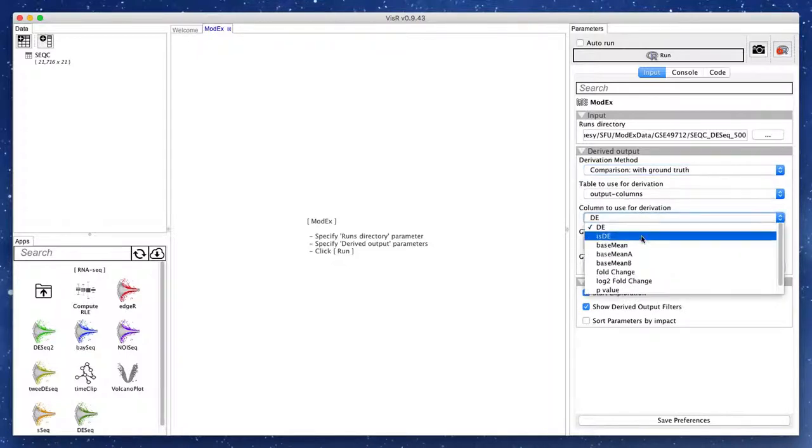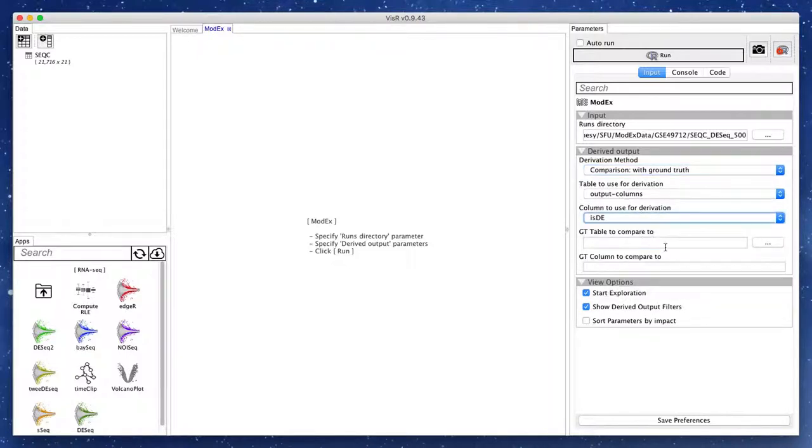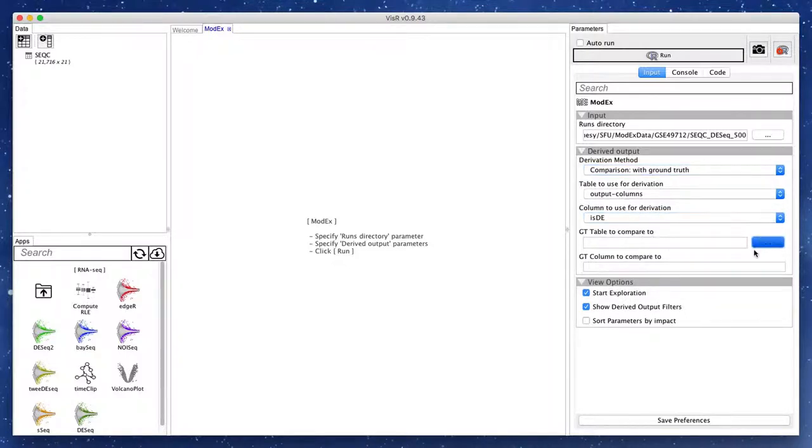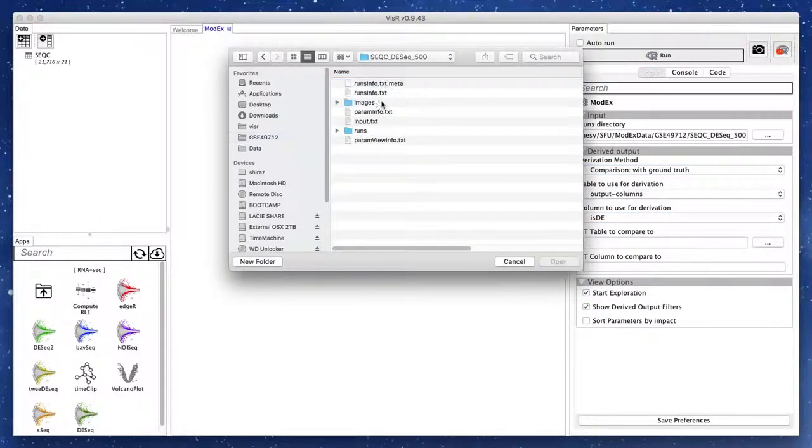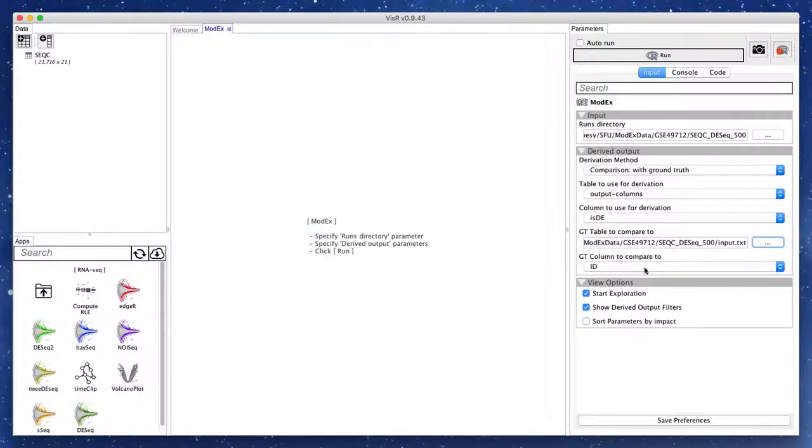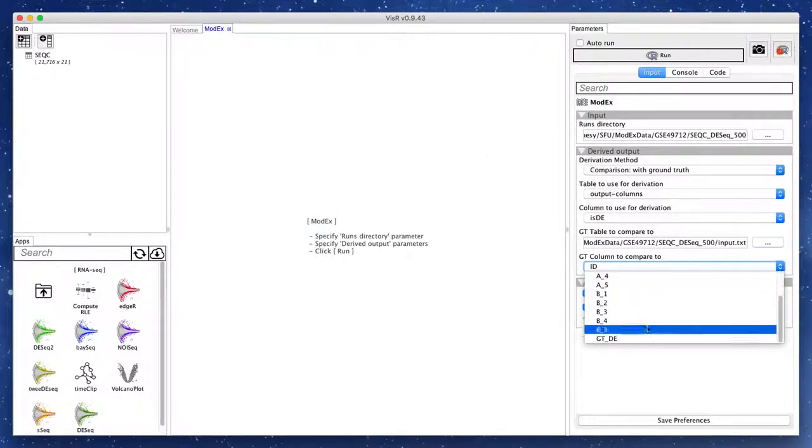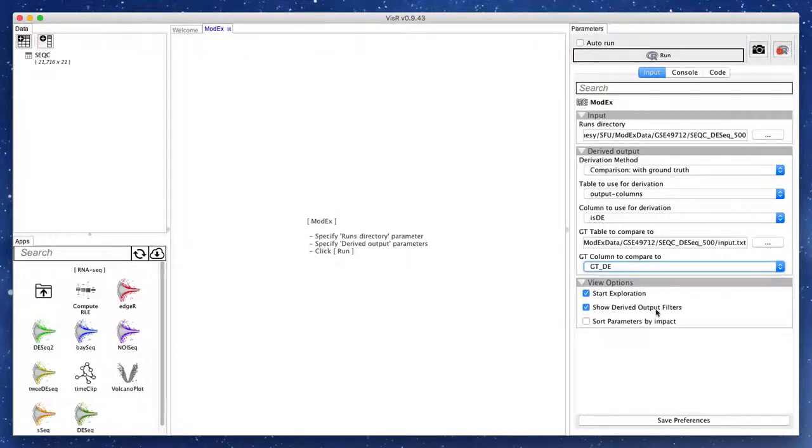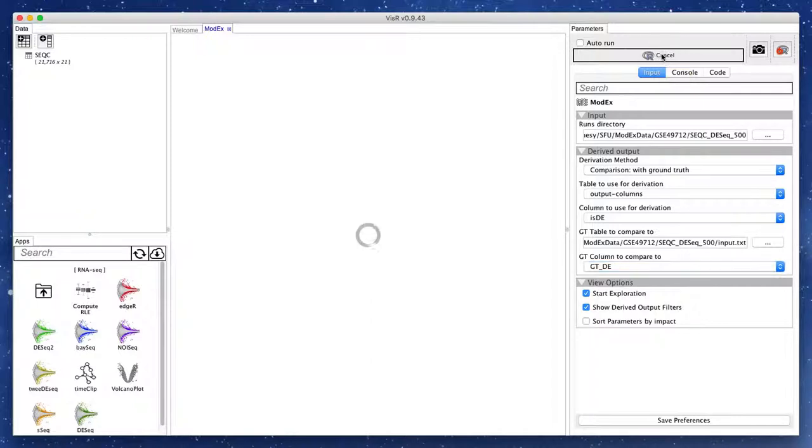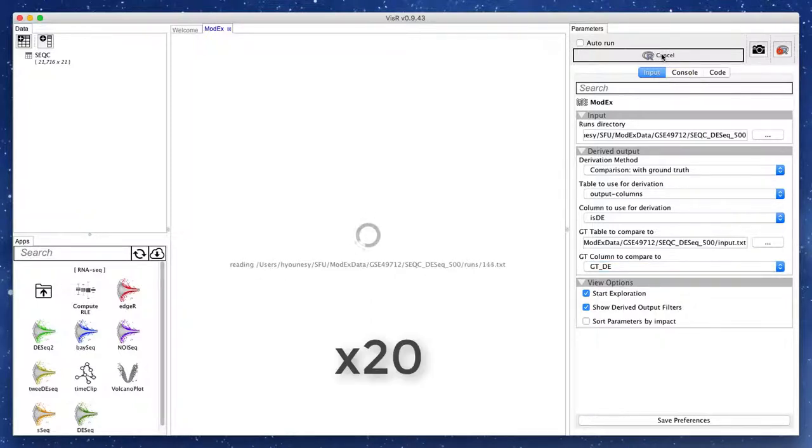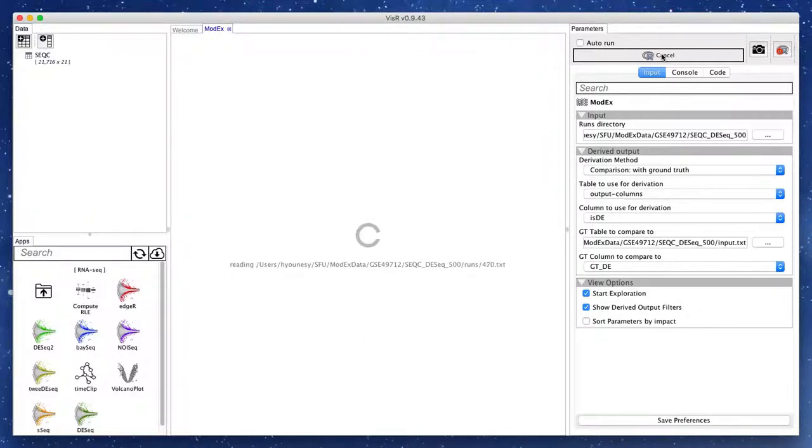We provide a wide range of derivation methods described in more details in the paper. Here, we compare the isDE output of each run with the ground truth DE column of our input table. This will go through all 500 runs and count the number of matches and mismatches between the ground truth and the computed DE states.